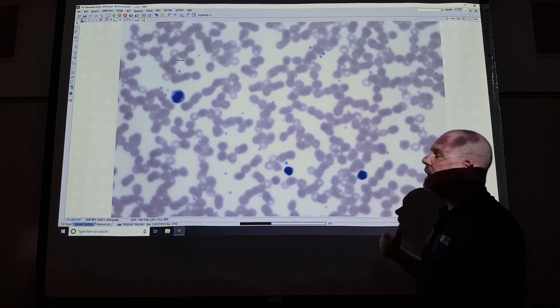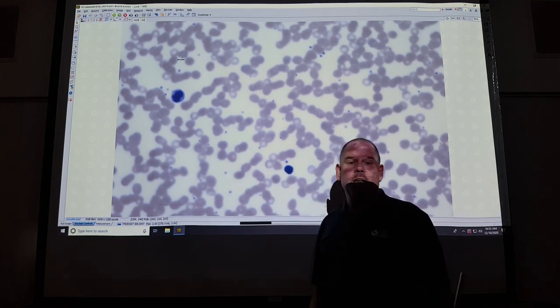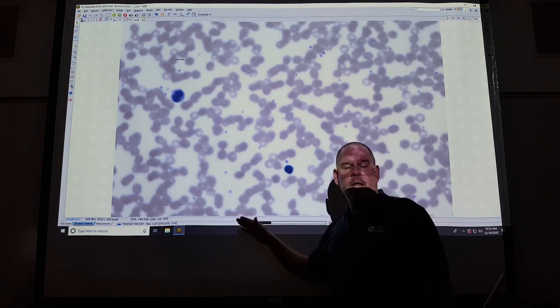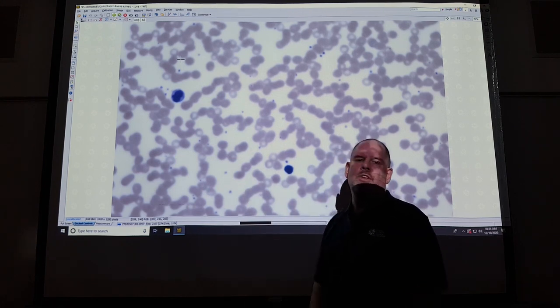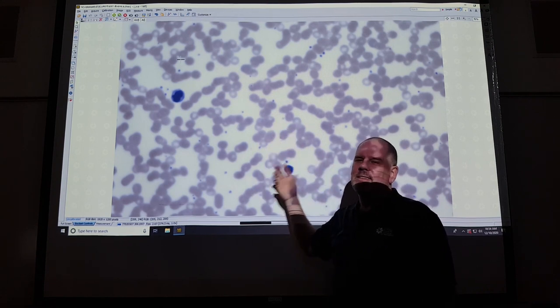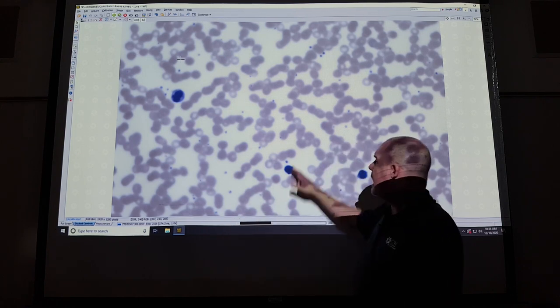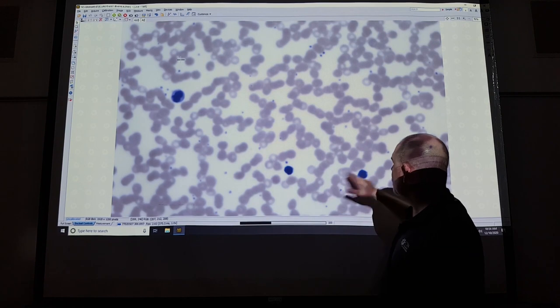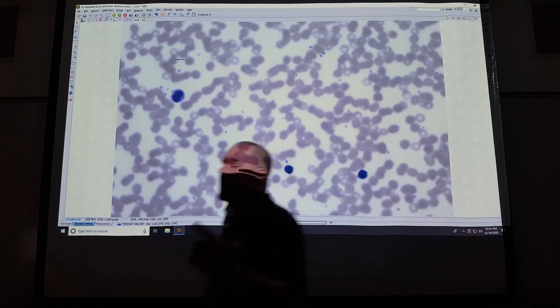Platelets right here. Now, occasionally, I've been doing this long enough, a student looks at a blood smear, particularly across the hall in 224 lab, when they make a smear of their own blood, and the student sees platelets and they think they have a bunch of specks of dirt in their blood or some sort of pathogen. No, this is completely normal to see these. If you had little specks of dirt in your blood, you'd have a lot of cardiovascular issues, trust me. But these small cell fragments are platelets. Platelets, leukocytes, erythrocytes, blood, a 60-mile-an-hour connective tissue.